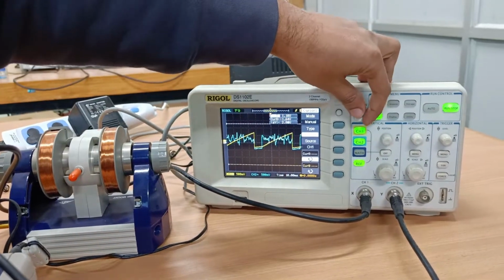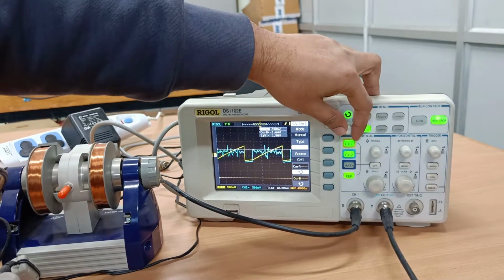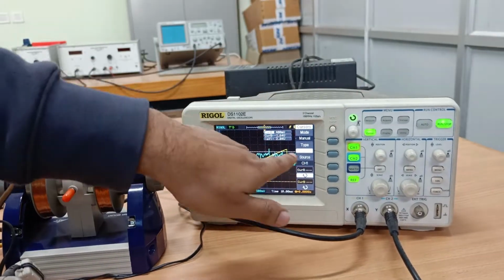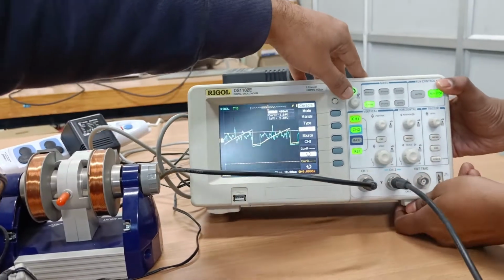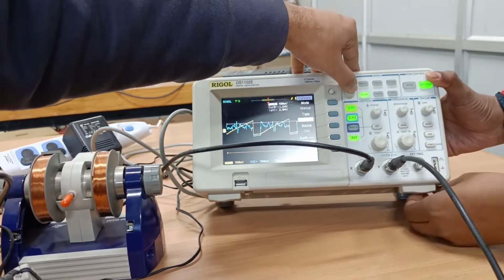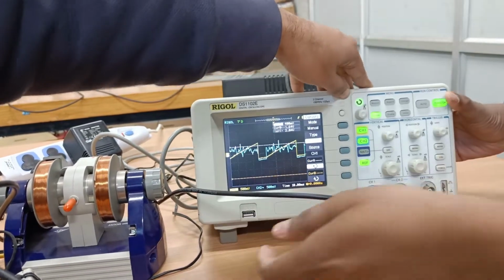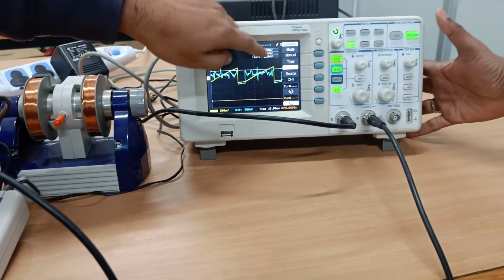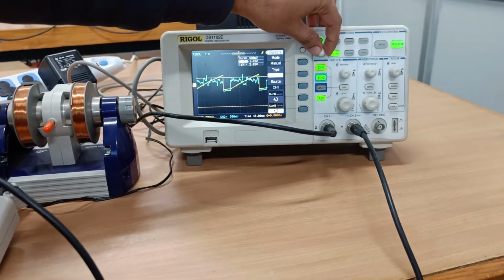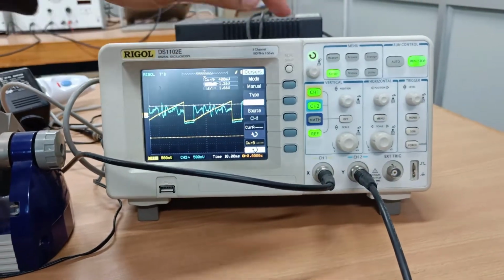After choosing this, we can move the cursors. Now it is chosen as cursor A. How to choose cursor B? We have to press here, and it will move to cursor B. Again if we rotate this, the cursor will be shifted.